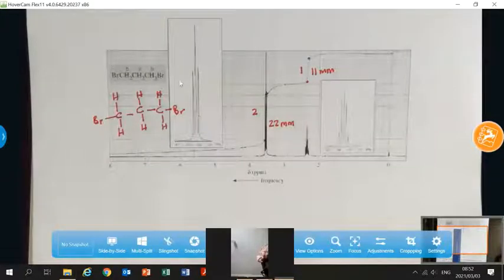But I will just go through that again just now after I make my point about the integration, right? To show you that you can also use what we learned on Monday to determine where these resonances lie. But if I just use the integration, I know that there's two protons here and there's four protons on the outskirts of the molecule, leading to the resonance for B. And that is in a ratio of 1:2 or 2:4, right?